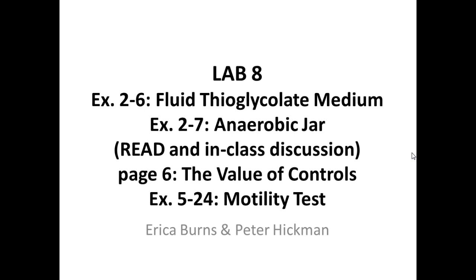Page 6 in your lab manual is what we're going to refer to today because it's going to talk about the importance of controls, right? And as we do a lot of these tests, we're going to be doing controls. So one of the things that we did last time too is we even set up a control on our gram stain slide, right?